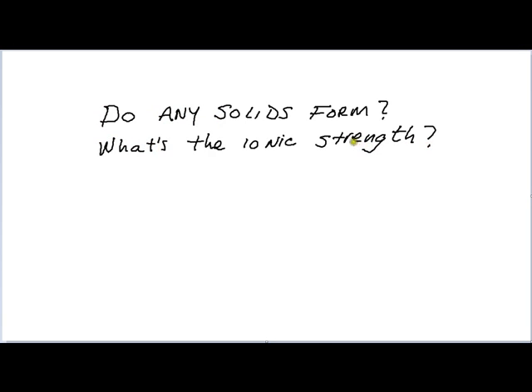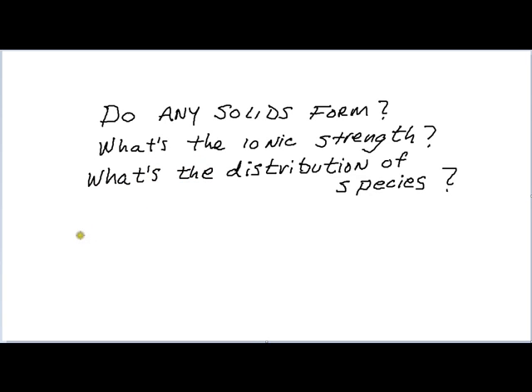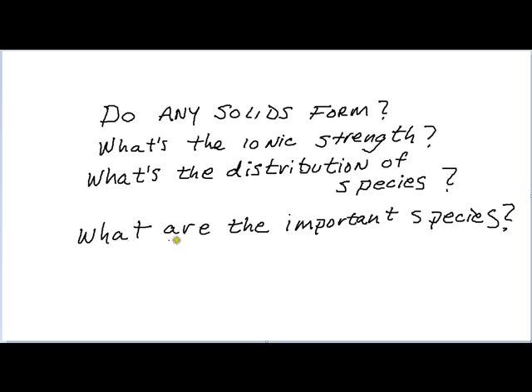Like, do any solids form? What's the ionic strength? What's the distribution of species? Are there any particular species that are important? Which species dominate?